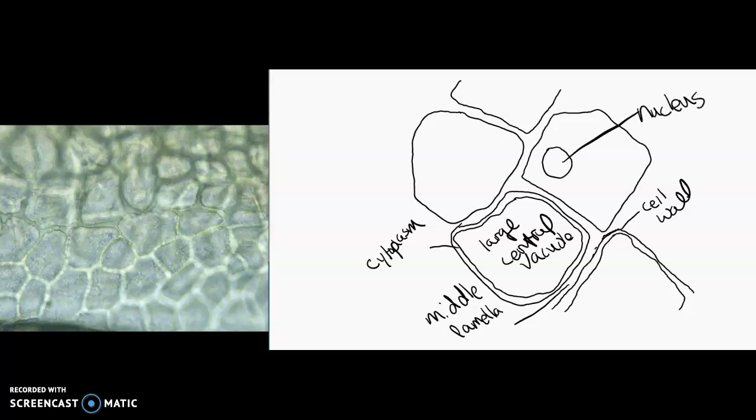And then right up against that cell wall, pretty much indistinguishable from the cell wall, is that cell membrane. Really, the only time you're going to be able to see that cell membrane is when it's pulled away from that cell wall.